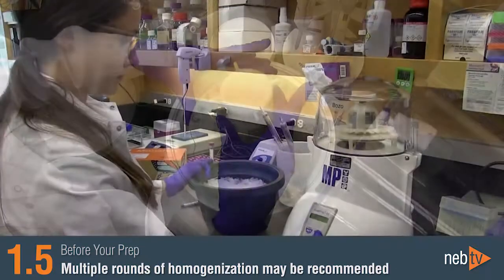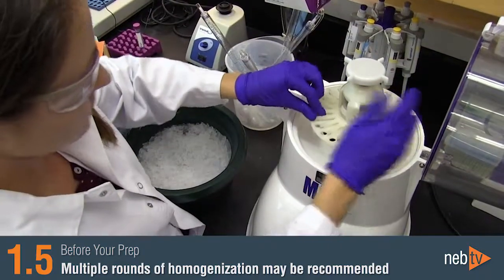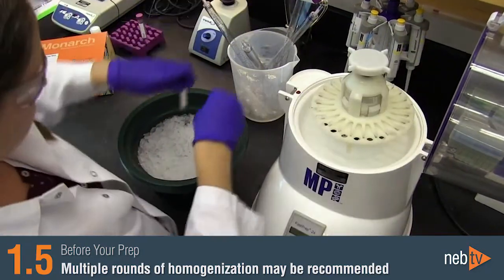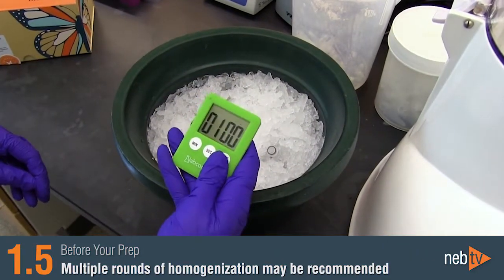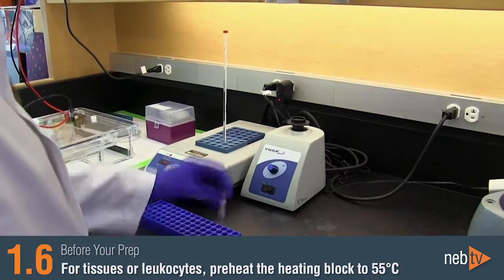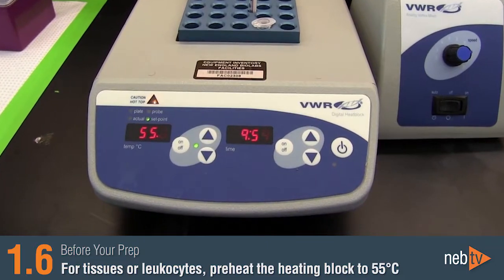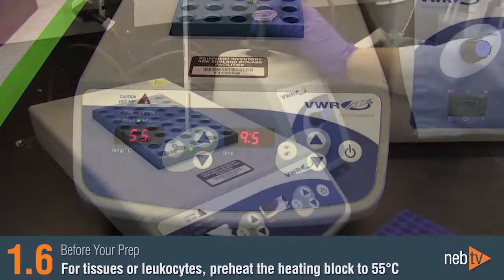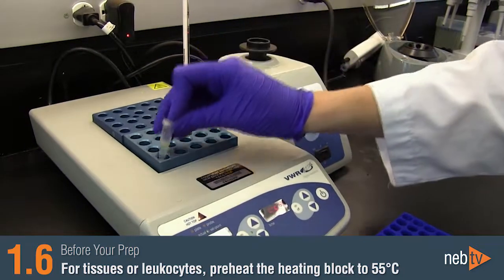When using mechanical lysis and homogenization, multiple rounds of homogenization may be recommended. If you do use multiple rounds, place your sample on ice for approximately one minute in between rounds to prevent your sample from overheating. If you are working with tissues or leukocytes, it can help to preheat your heating block to 55 degrees Celsius before starting your prep so that the heating block will be at the correct temperature when you get to the proteinase K incubation.